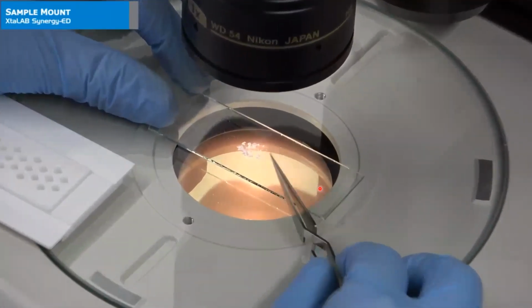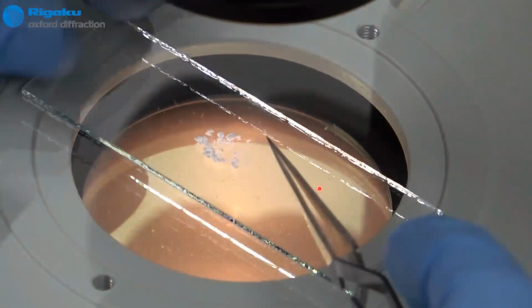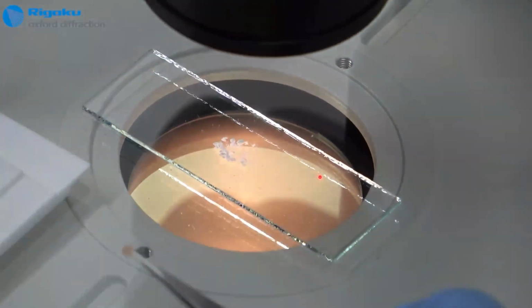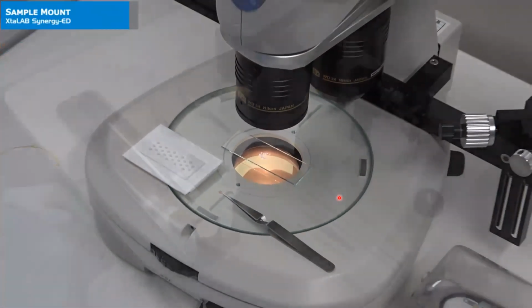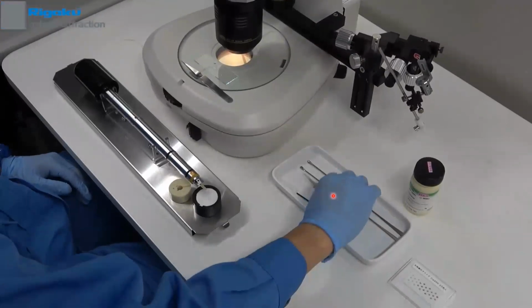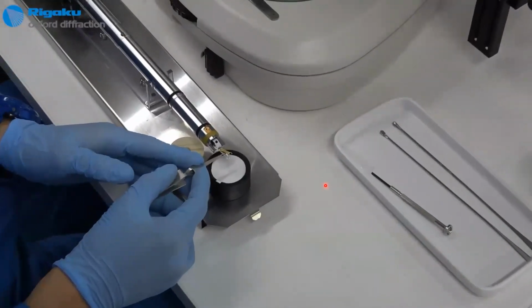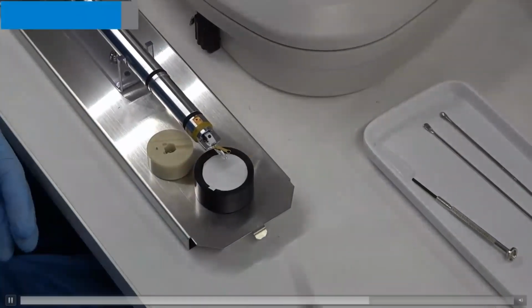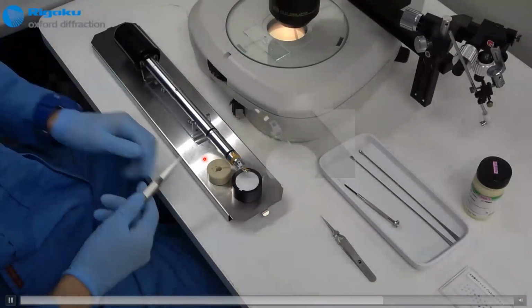They will stick on it. They're a bit of too big ones, but you can just shake them off, as shown here. And now you'll have deposited just a thin layer of powder, which also will likely include some small enough nanocrystals on your grid. As the next step, this grid is mounted into this piece here, which we refer to as a sample holder or sample transfer arm.